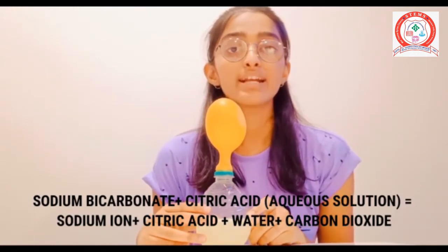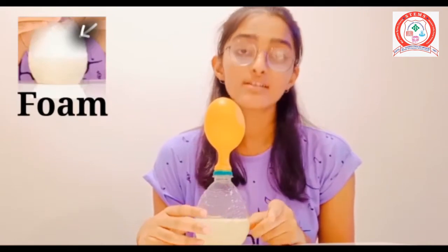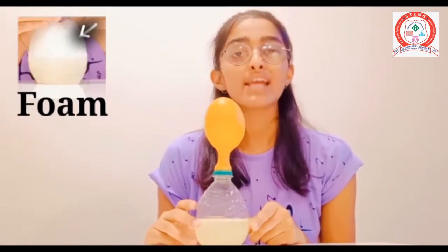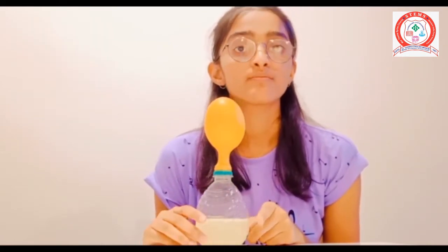As carbon dioxide is released, the foam rises in the bottle. So that was an acid and base reaction. Thank you.